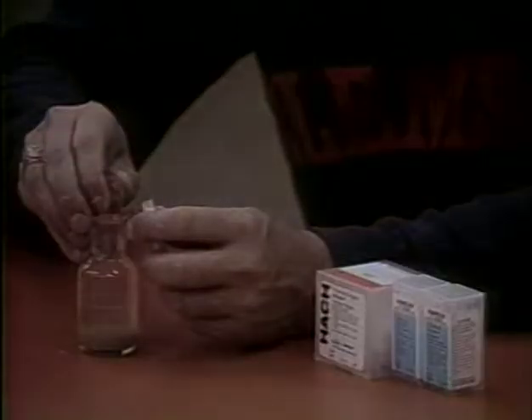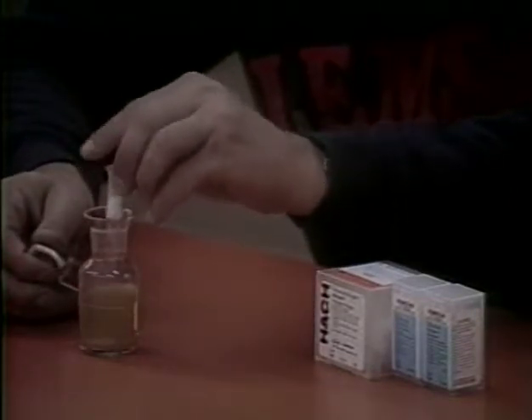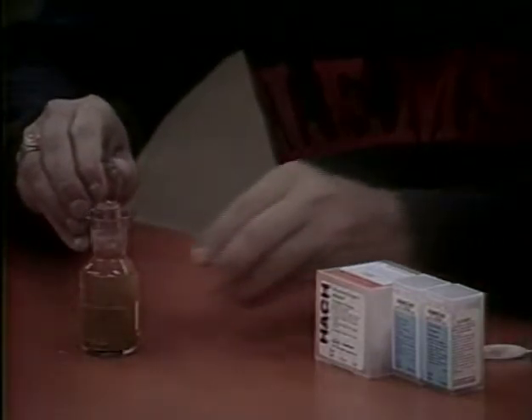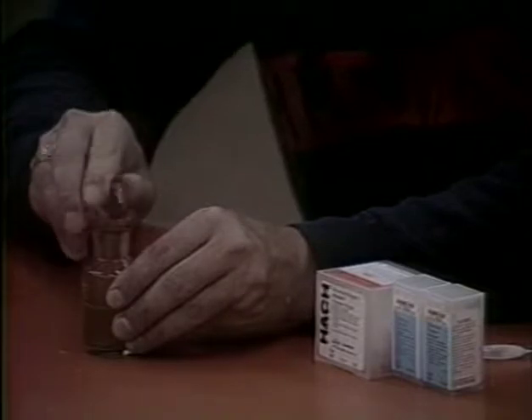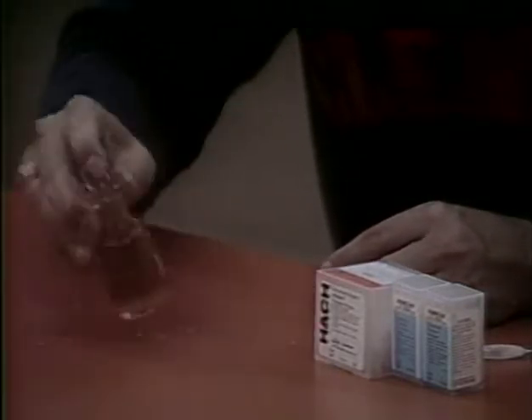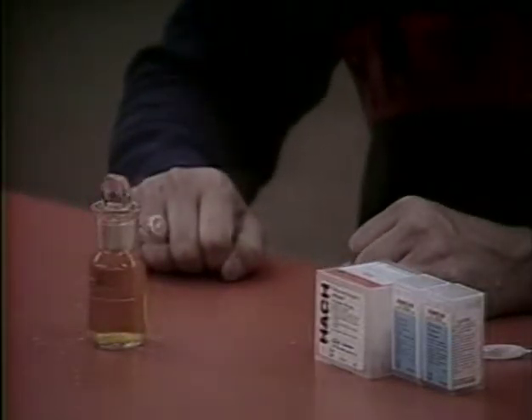Remove the stopper and add 1 dissolved oxygen 3 reagent powder pillow. Restopper and shake several seconds to mix. If air bubbles result, obtain a new sample and start over. After shaking, the flock will dissolve and a yellow color will develop if oxygen is present. This is now referred to as a prepared sample.